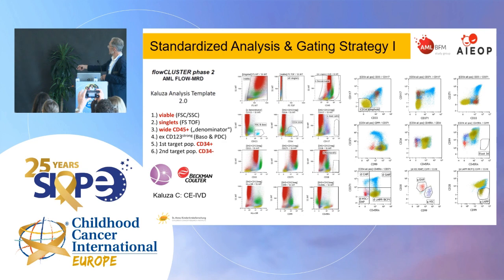If you look with me at that chart, starting from here, there are the most immature cells, and they can go into two directions, from here to there. These are the most mature, the GMPs, the granulocytic monocytic precursors, and so they develop into those directions.